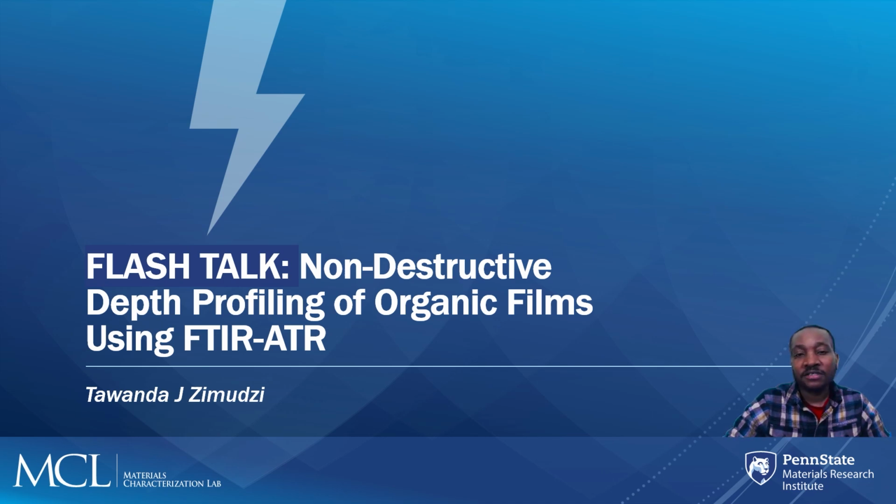Hello, my name is Tawanda Zimudzi, and I'm going to talk to you a little bit about using FTIR, specifically attenuated total reflection, to do depth profiling in materials.